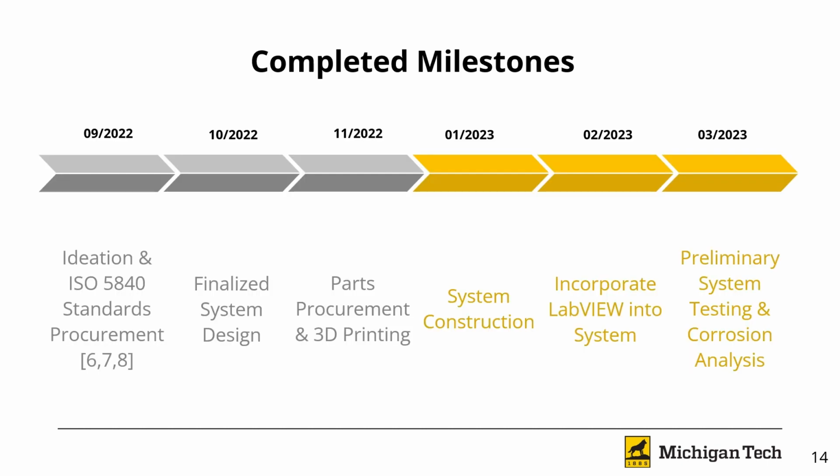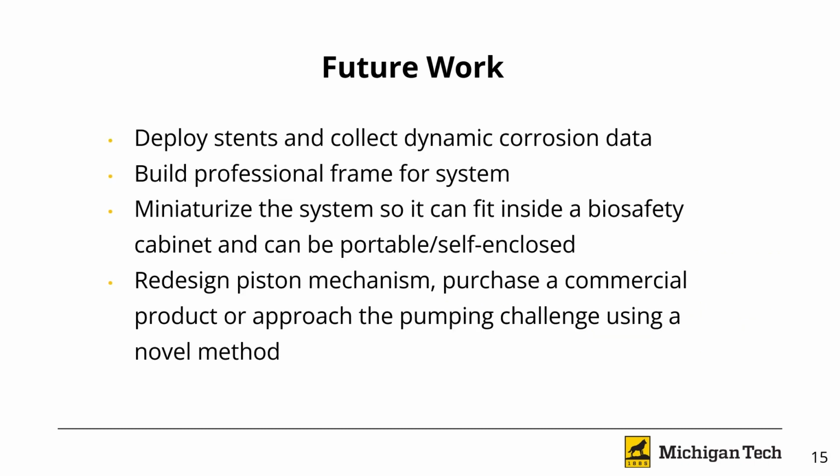This semester we completed the system construction, the incorporation of LabVIEW, and preliminary system testing and corrosion analysis. The future work for our system includes deploying stents into the arteries and collecting and analyzing dynamic data. We also recommend building a more professional and permanent frame. The piston pump mechanism should be redesigned using commercial products to minimize some of the challenges associated with the pump. Lastly, it would be ideal to miniaturize our system for better portability and to fit in a biosafety cabinet.